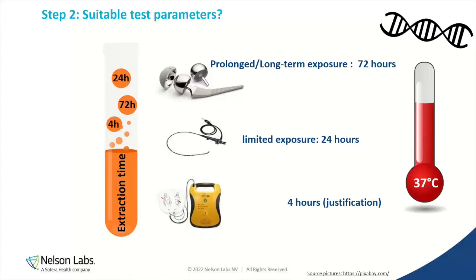This is not allowed. I think 4 hours is the minimum extraction time. I don't think you can go lower according to the ISO or what regulatory expectations are. You can go lower, but only after you have a clear fail after 72 or 24 hours, and then you can justify and say, okay, 4 hours because there's only 2 minutes contact time, whatever. But that's part of a justification. So don't go lower, although you would say, I think it's okay. It sounds scientifically correct. 1 minute, 4 hours extraction, perfectly worst case. That's not the reality. Yeah, that's absolutely true.